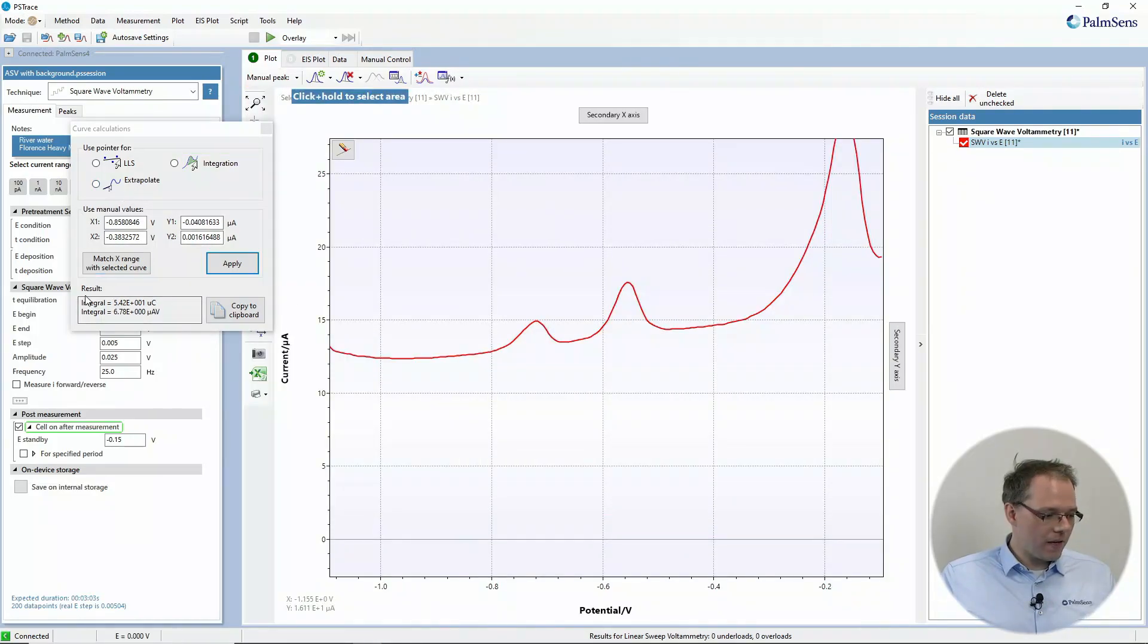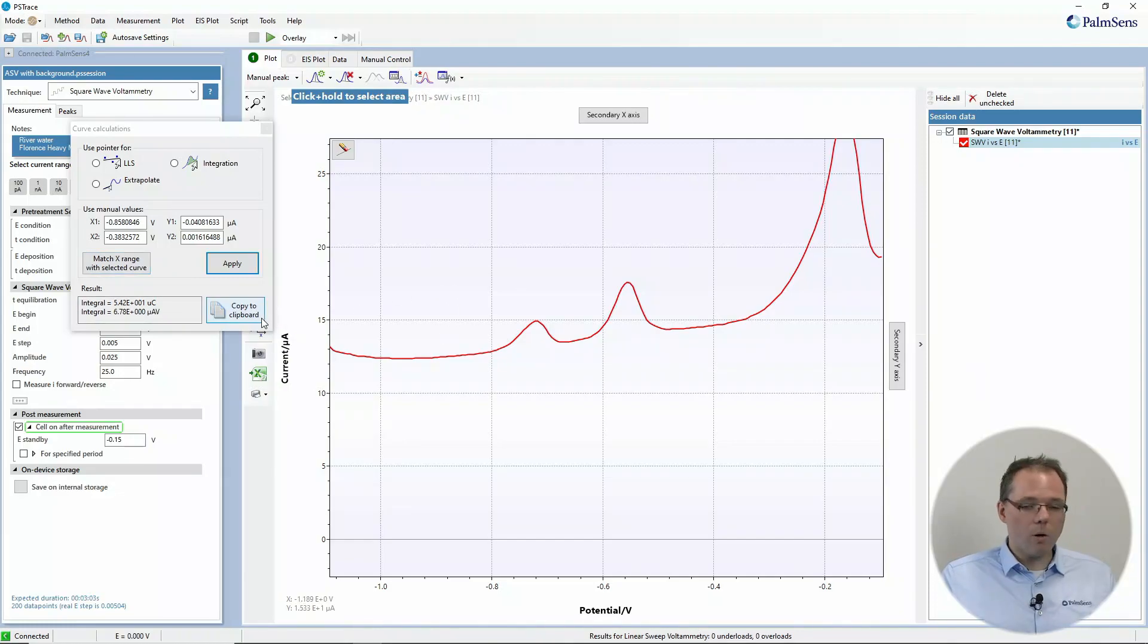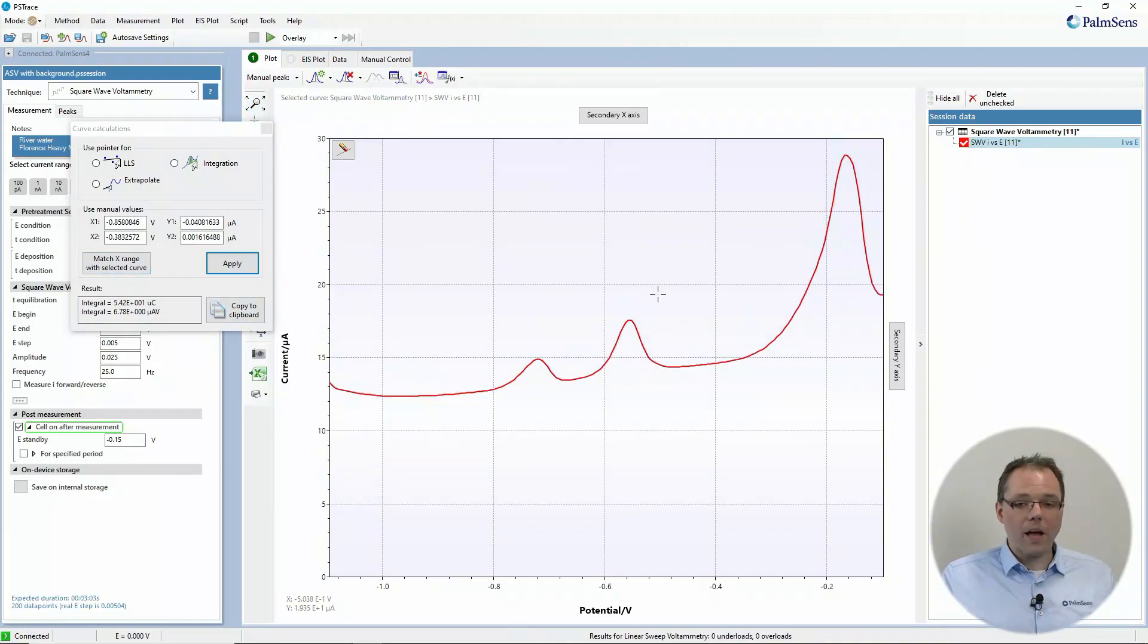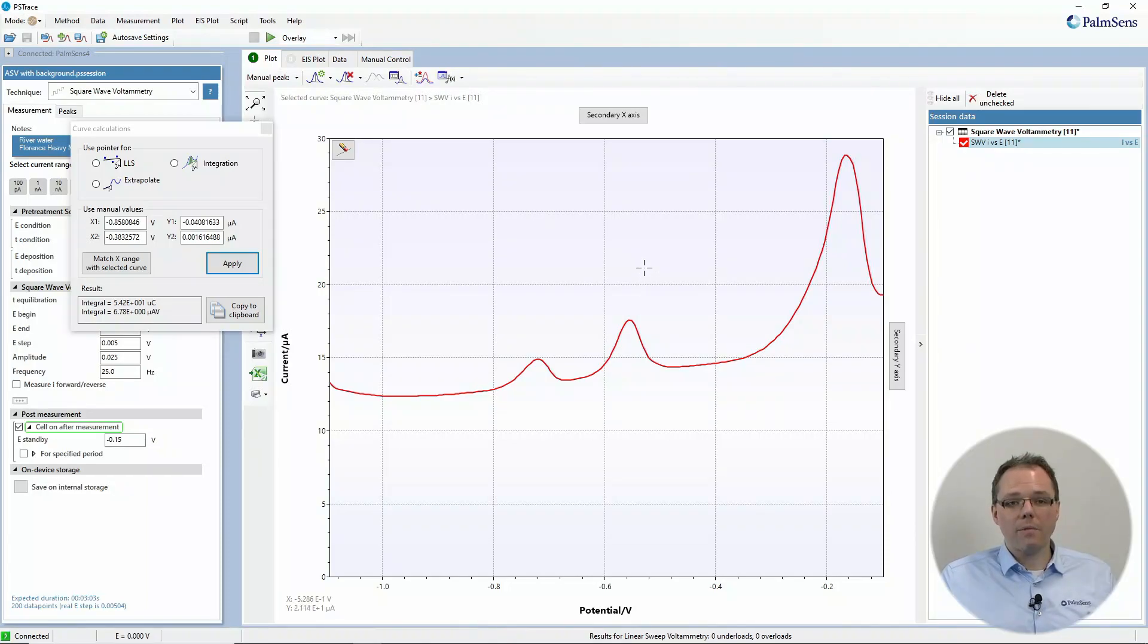So then you finish. You have your values in here. You copy them to where you want to have them. And that was already the integration part, how to do it manually. The next thing I would like to talk about is linear regression.